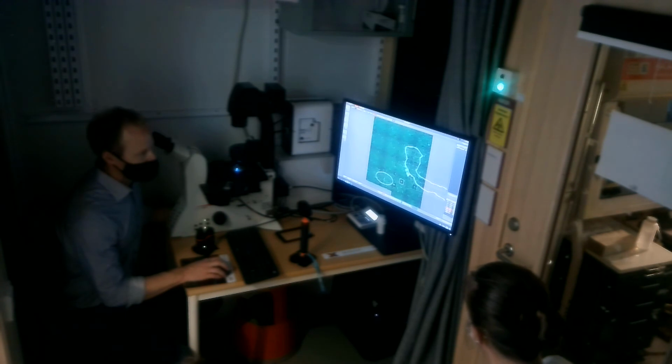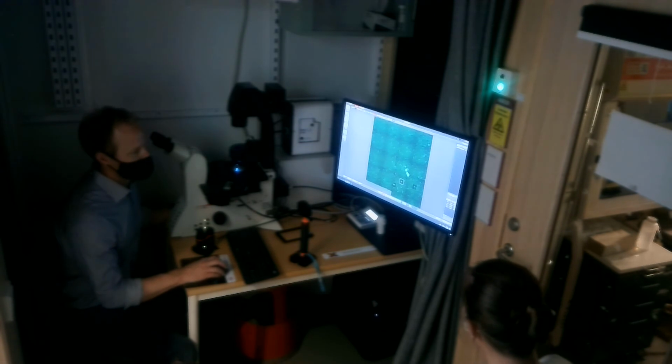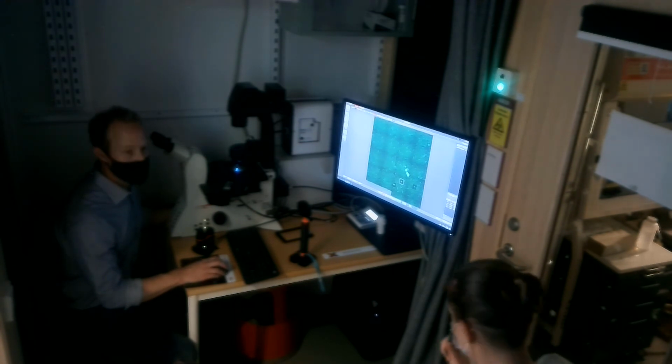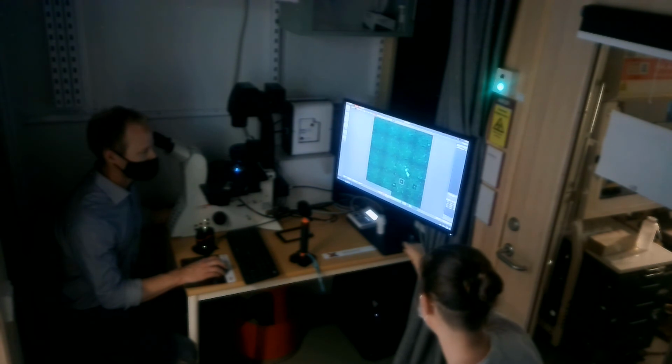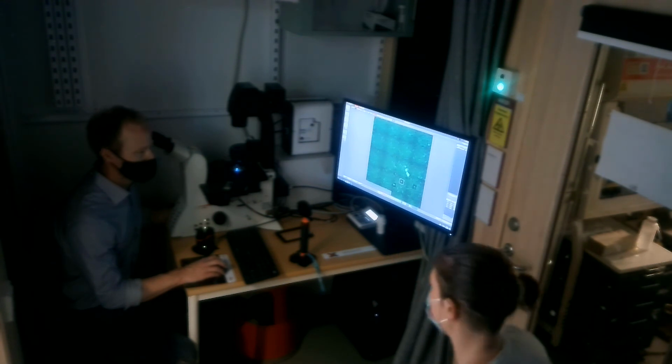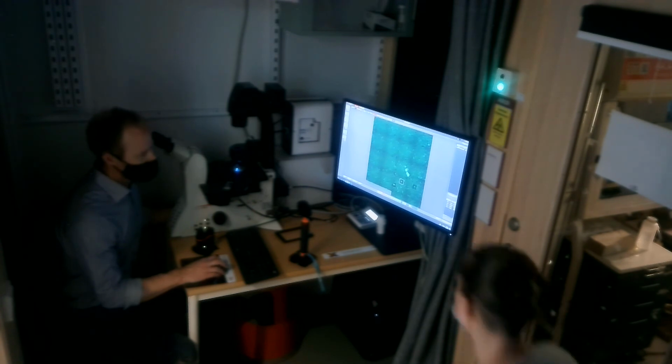When you have done a polygon, you have all these little squares, so you can pull those out and you can resize the polygon also if you want. Okay. So that's the region of interest tools. Yes? Just one more thing, whenever we do anything in the region of interest tools but mark, the Z position is not saved or anything, right? No, exactly. It's only with the mark position.